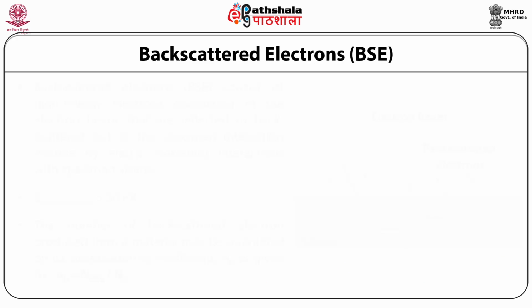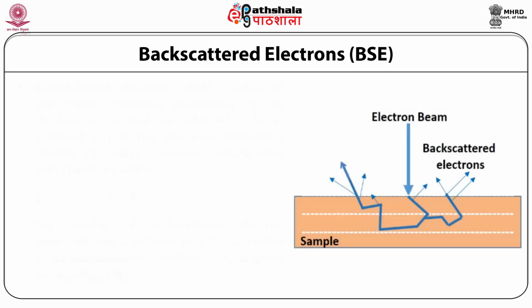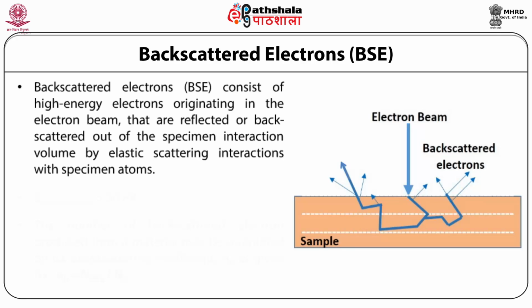Now, the backscattered electrons. Elastic scattering of the electron beam produces backscattered and transmitted electrons, as the strong electrical field of the specimen's atomic nuclei deflects them, and no additional electrons are produced from the sample. Transmitted electrons pass completely through the material after interacting with it, while backscattered electrons are ejected from the top surface of the specimen at high angles.